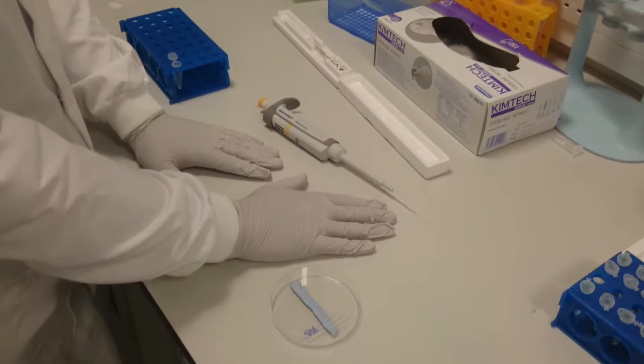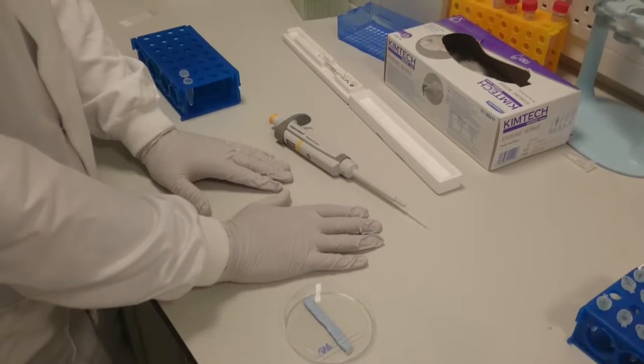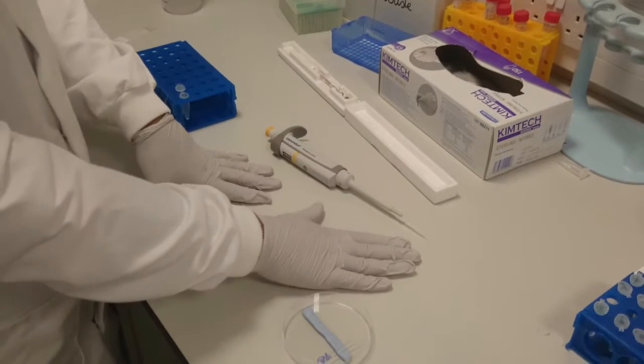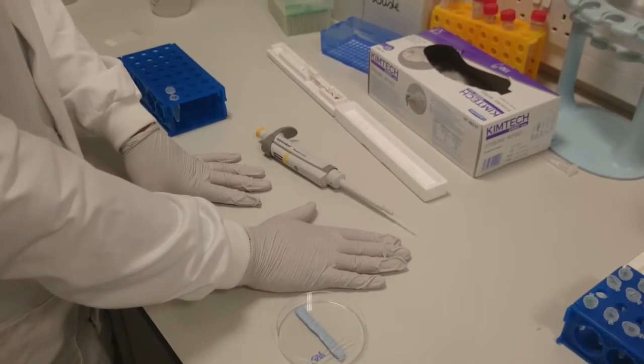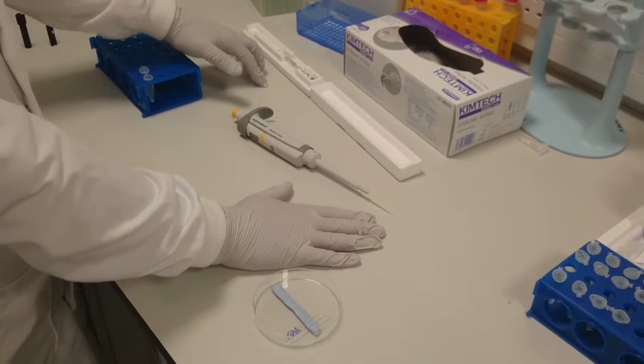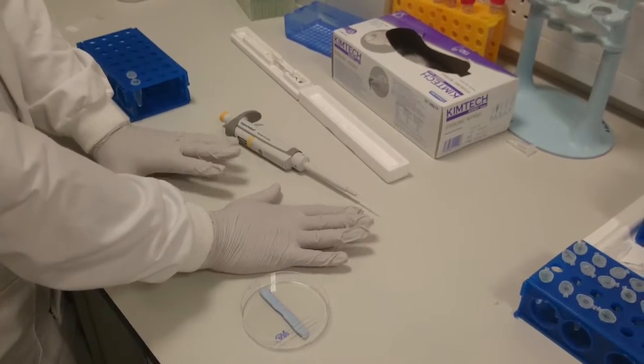The Hamilton syringe works out cheaper over time with samples, it's easy and it's hard to get wrong. The gel tip is better if you've got very small volume, very precious samples. Occasionally the Hamilton doesn't pull up all your volume, whereas the gel tip is really good for picking up everything. Also, with very sensitive samples, you can get some carryover with the Hamilton. The gel tip, which is disposable, means that you don't have any carryover ever.